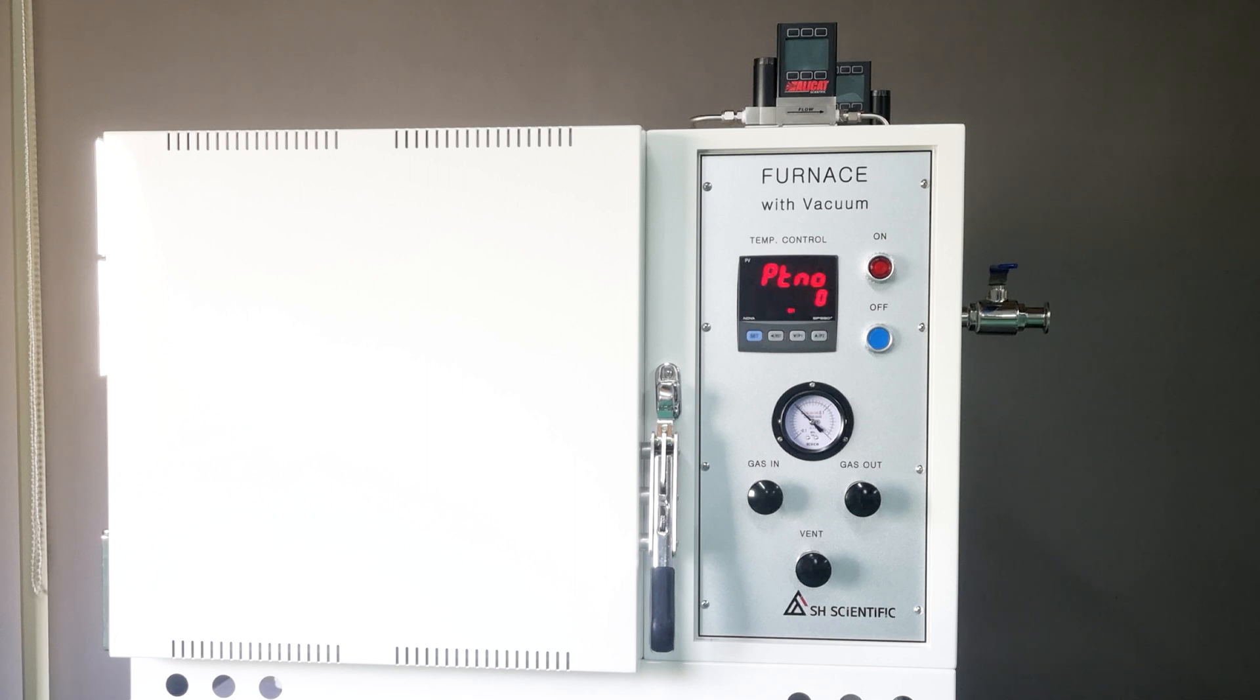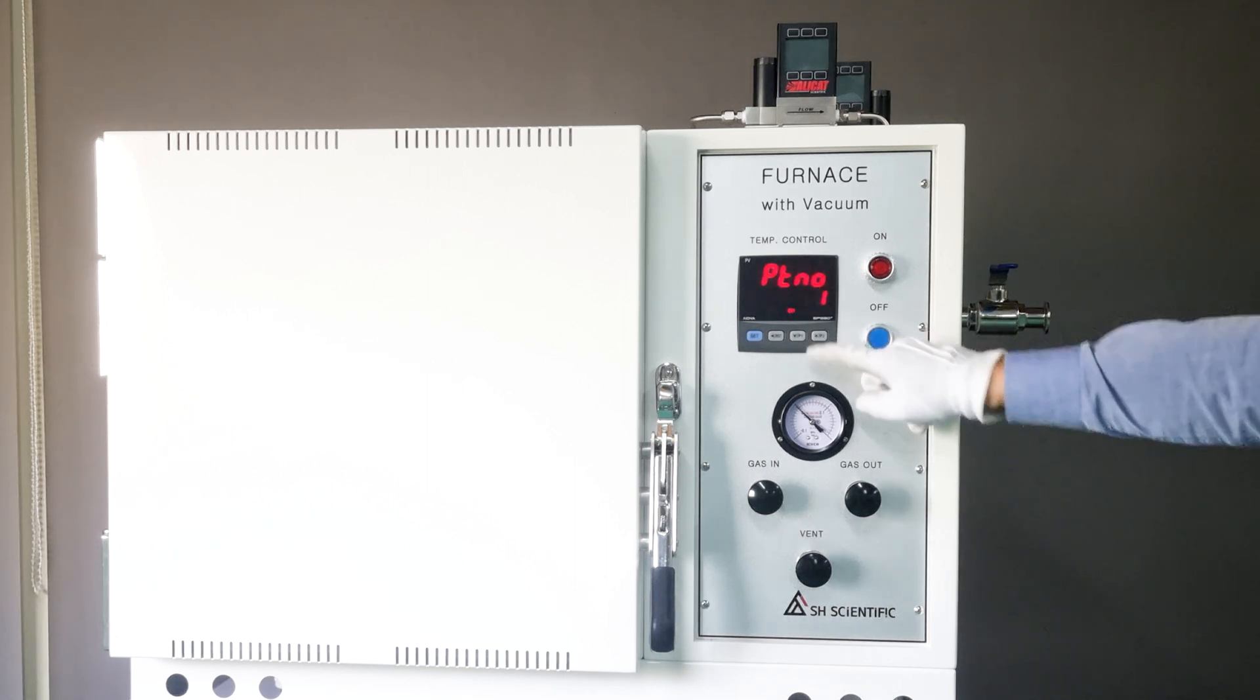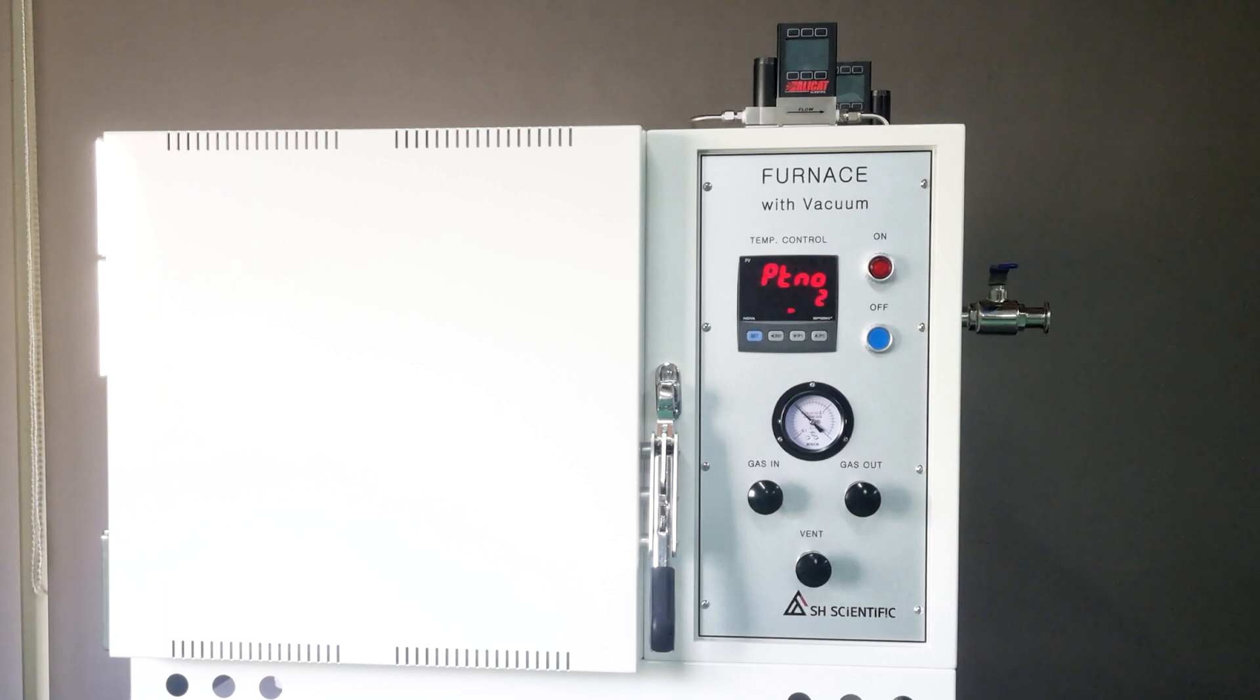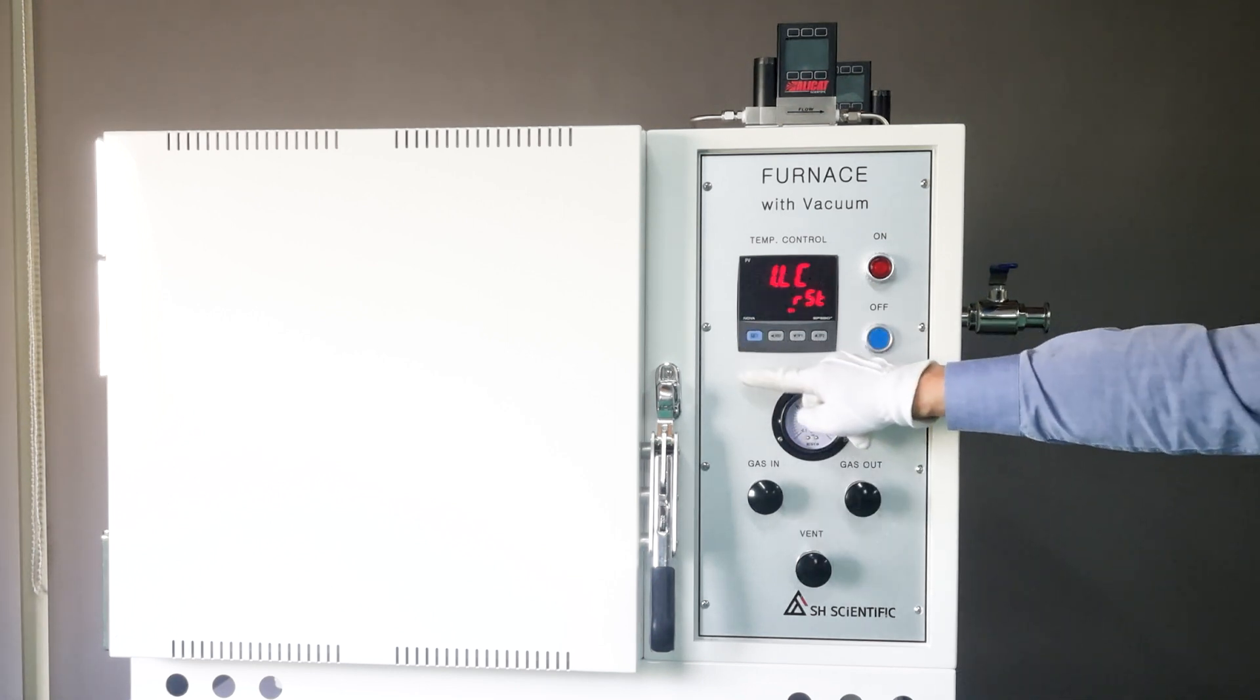Like I briefly mentioned earlier, our SP Series Controller has Pattern 1 and Pattern 2. You can set up to 15 steps apiece, for a total of 30. Input your pattern number 1, then click the set button.